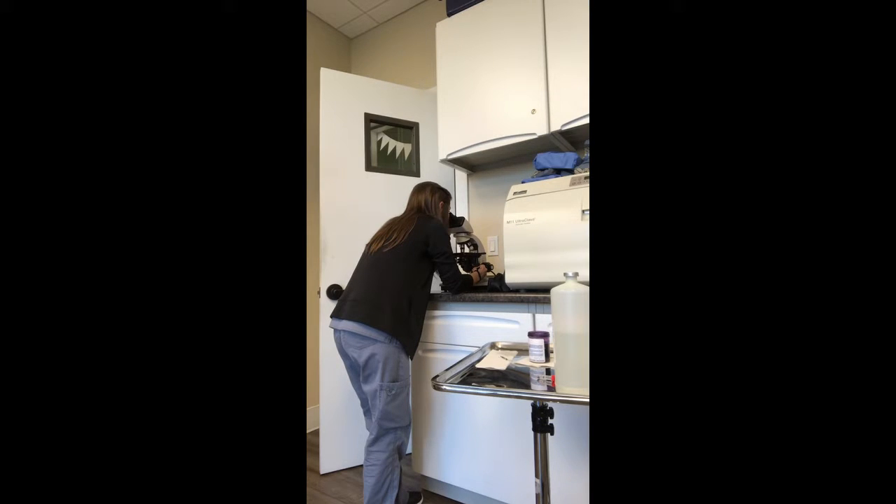I don't seem to see any, so I believe that this modified Knott's heartworm test is negative.